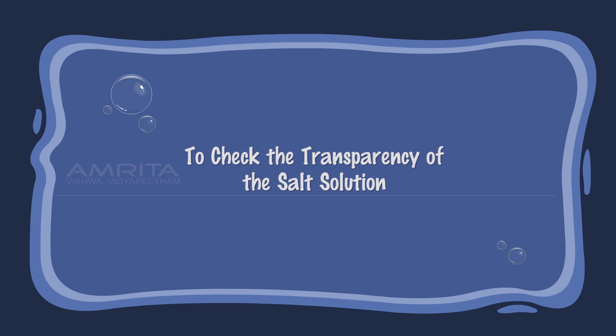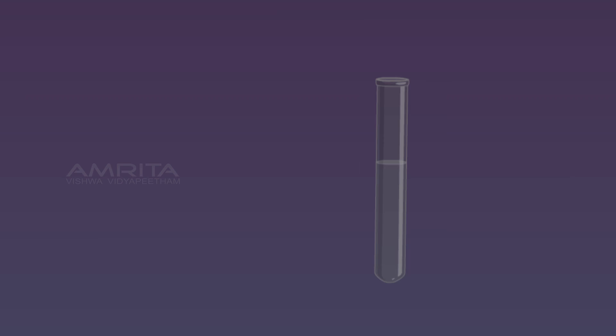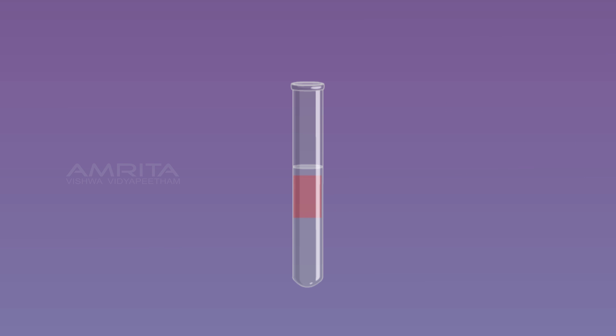To check the transparency of the salt solution, take some salt solution in a test tube. Paste a small strip of cellophane paper on one side of the test tube and view it from the other side. The cellophane paper is clearly seen from the other side, indicating that a true solution is transparent.